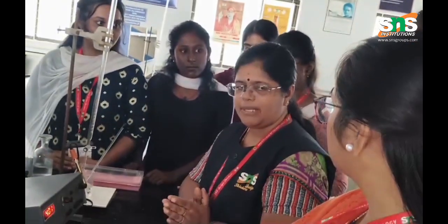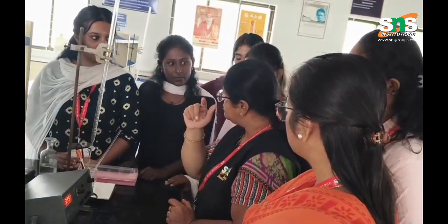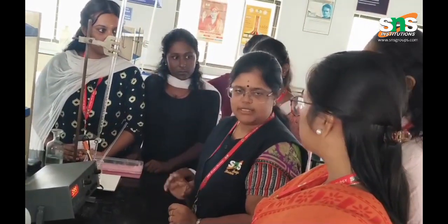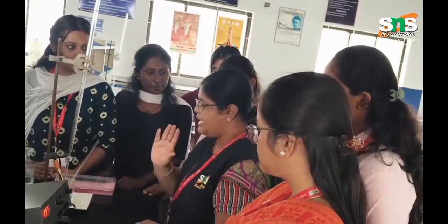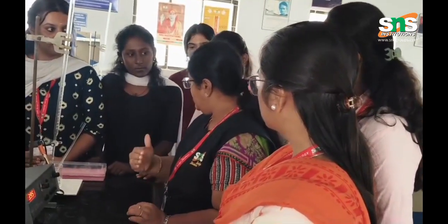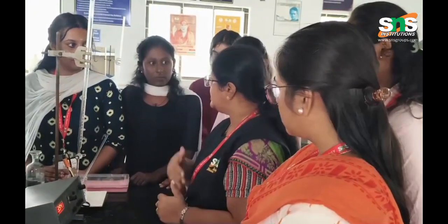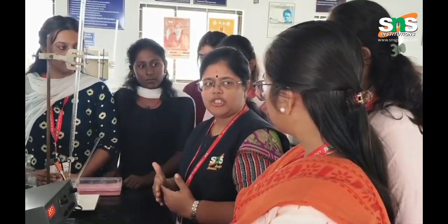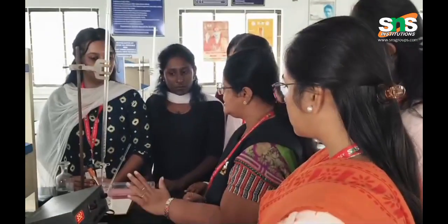What will happen first? The base reacts with the acid. First the neutralization of HCl is done, because it is a strong acid. Then, after that end point, there will be an increase in the conductance value of the solution, due to the formation of sodium acetate ions. There is a slight increase.